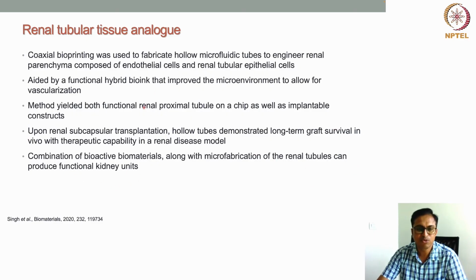So this kind of work has shown the promise of developing functional kidney tissue units by combining bioactive materials and 3D microfabrication techniques like 3D bioprinting. Specialized kidney structures, kidney tissue structures, can be very well developed.